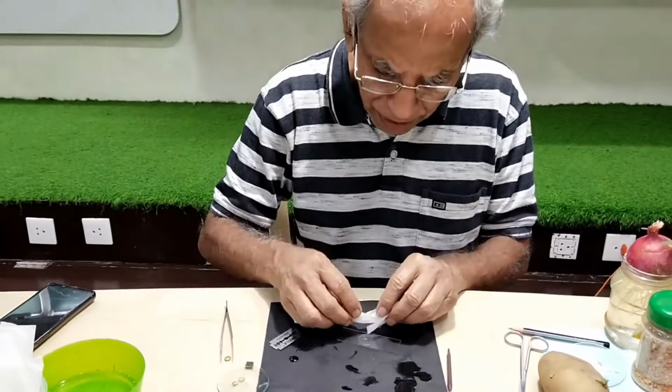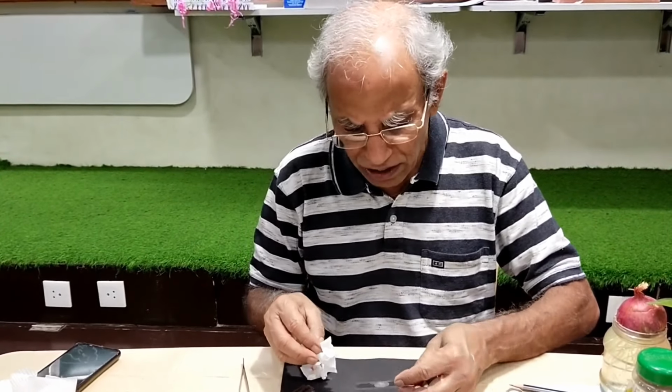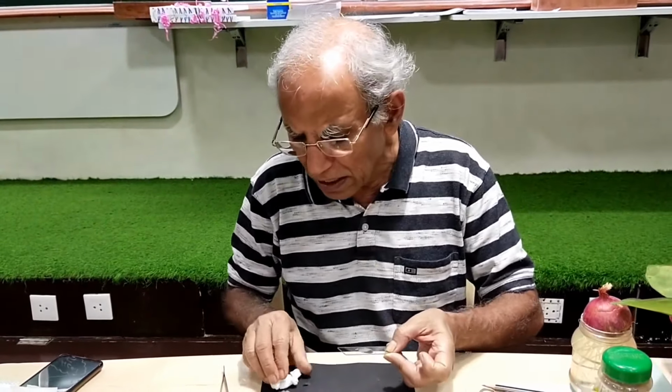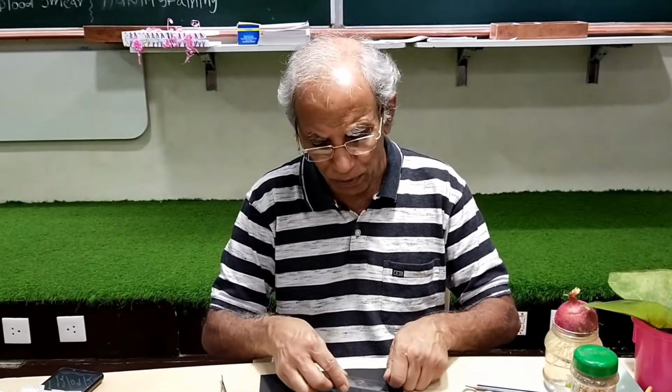No staining is required. You don't think that every time you require staining. That's not really the need. Staining is required only if you want to differentiate things. And many times the slides made like this are more than enough. You don't need to always stain the slide. I will now put it under the microscope.